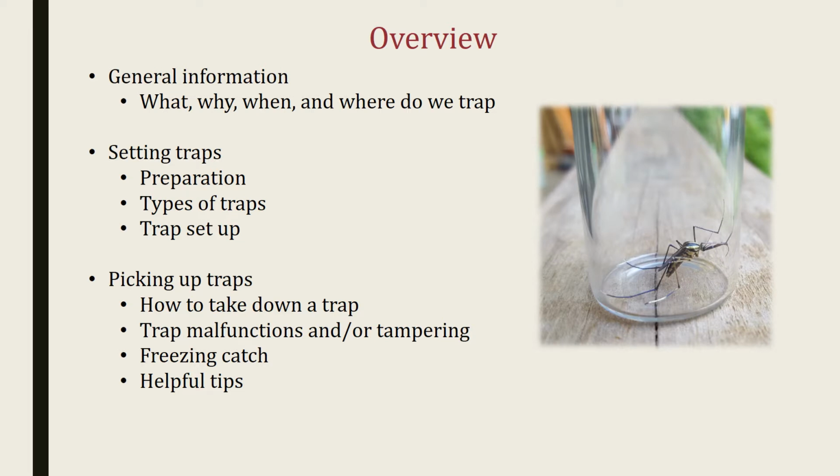In general, we will be talking about the what, why, when, and where do we trap. For setting traps, it involves the preparation, types of traps, trap setup. For picking up traps, we'll talk about how to take down a trap, trap malfunctions and or tampering, freezing the catches, and helpful tips.